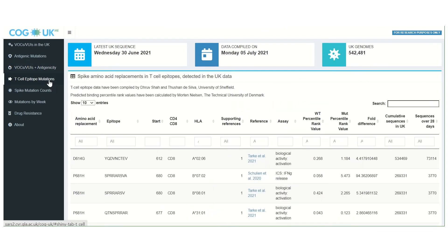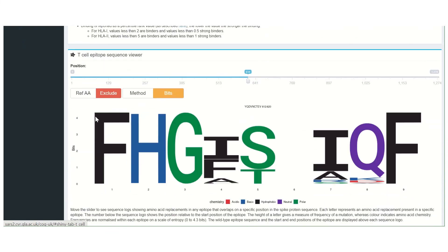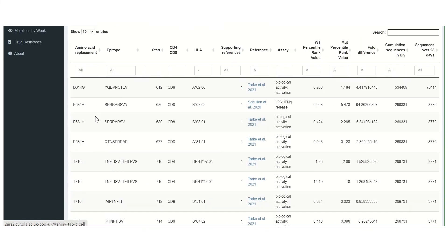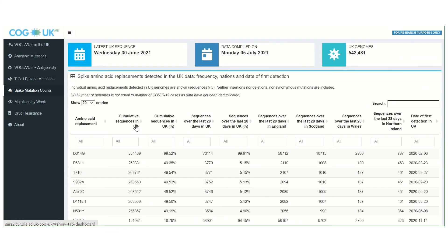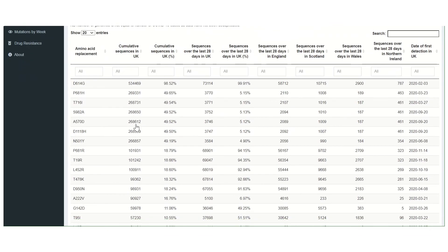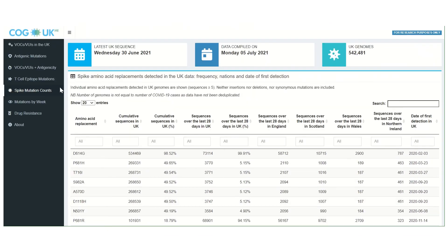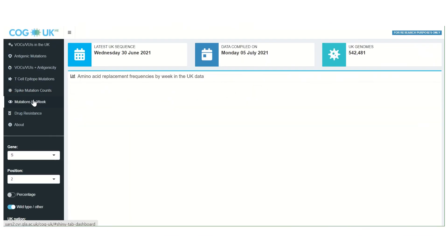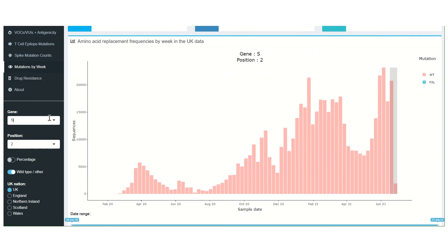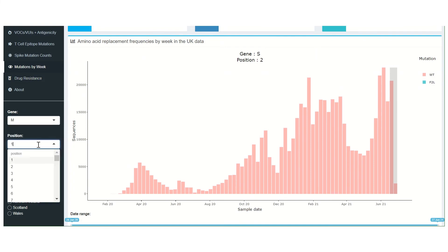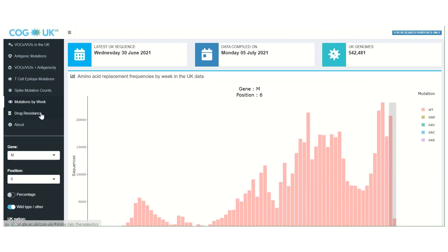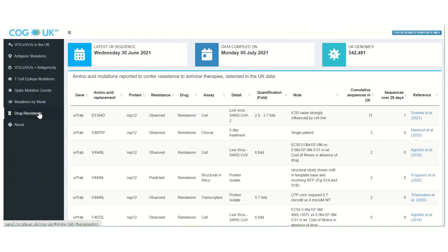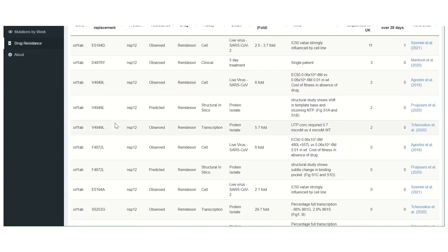On the other tabs we have a T-cell epitope mutation table and visualizer, a spike mutation count table, a graph that allows the frequency of specific mutations from any position of any gene over time to be visualized, and a table of mutations implicated in resistance to antiviral drugs.